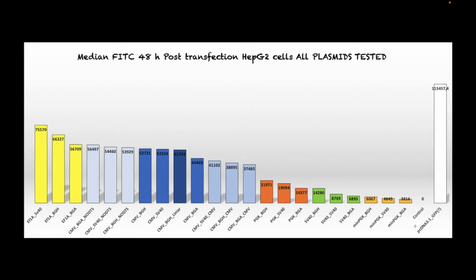And the last plasmid tested is called pcDNA 3.1 GFP. It's a type of plasmid that almost everybody uses in mammalian expression. So this is used for vaccines. I know David and Josiah and Daria use the same plasmid for their COVID vaccine or something like that. But as you can see, this expression right here is much more intense than my best expression plasmid right here. So why is this 75,000 and this is like over 100,000? Well, the answer is simple.